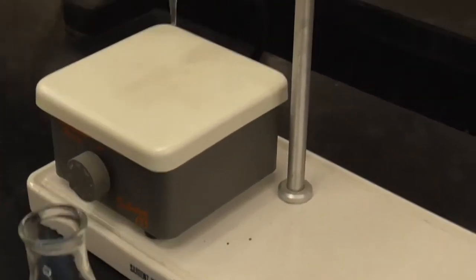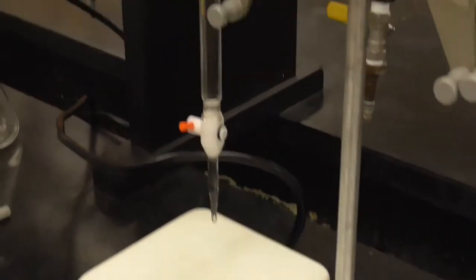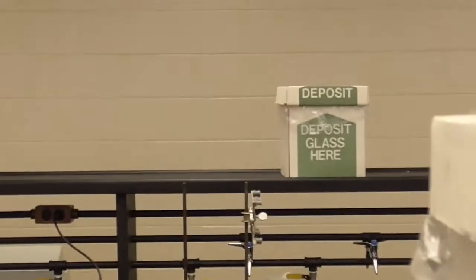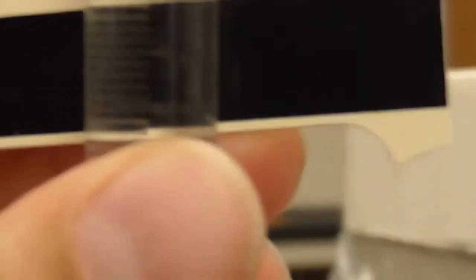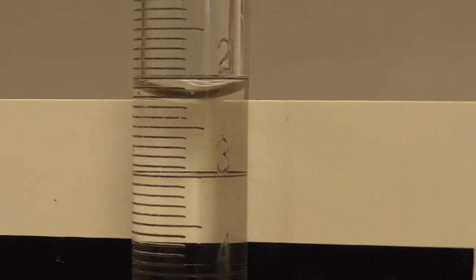And then we're going to do our titration. First, we have to note the initial reading on the burette. Let's see if you can... we're going to try to get around so you can see the numbers. Sorry folks, I'm having a hard time finding the burette on the camera.